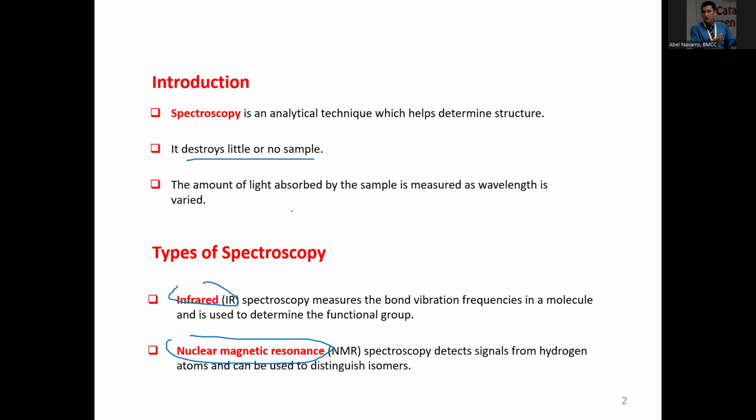Okay. And then we use, well, light. Of course, light is what is used because it's a spectroscopy spectrum, right? So it's a type of radiation, and the radiation can be labeled or designated based on the wavelength, right? Wavelength is what dictates the strength of a particular radiation.